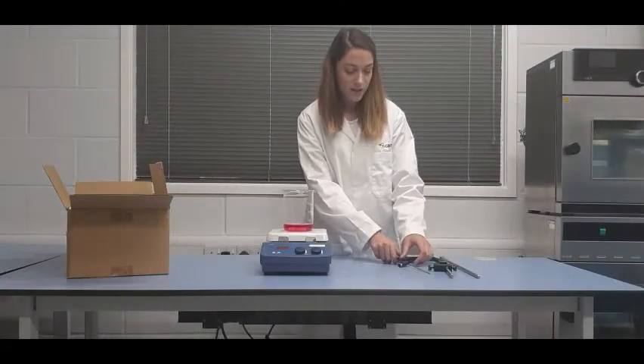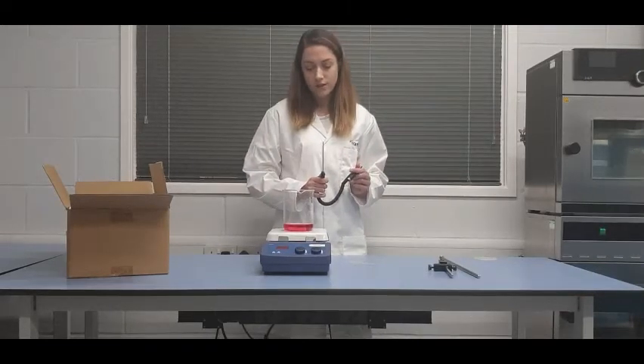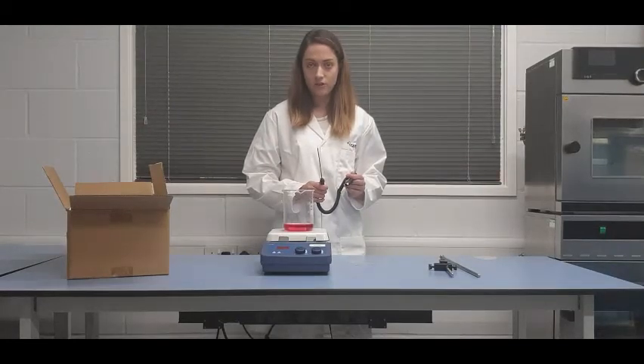With this hot plate stirrer, there is the option to use an external PT-1000 probe. This enables you to control the temperature of the heated sample itself rather than the temperature of the hot plate.